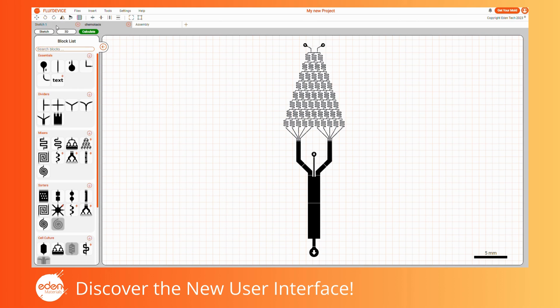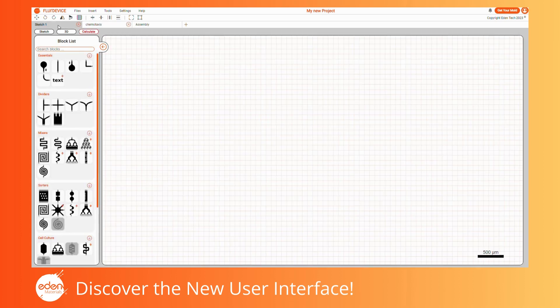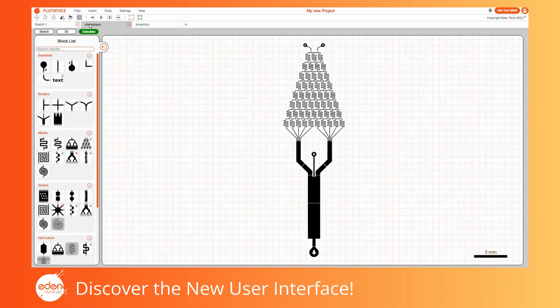Below the toolbar is the tab bar. Each project can have multiple sketch tabs and one assembly tab. Each sketch hosts one microfluidic design. On the left, you'll see three display buttons — Sketch, 3D, and Calculate — allowing you to switch between different modes of FluiDevice.